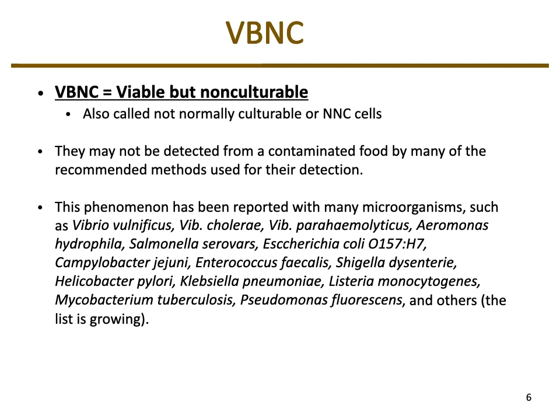And so that would be a huge downside, but we do have to be aware that they exist. So some of the Vibrios, Salmonella, E. coli, K. pneumonia, Listeria, Pseudomonas, again, traditionally they are more difficult to culture, like H. pylori. Some of these need just a different pH. So if we think about what we were talking about, factors that influence, we have to have culture media setups, incubator setups to meet those demands. And again, because these are kind of niche bacteria, the standard microlab isn't set up for that.